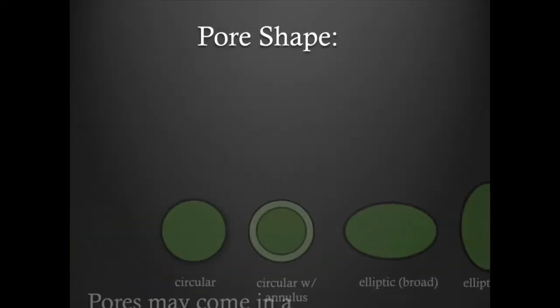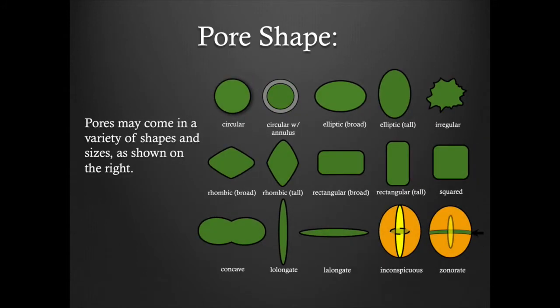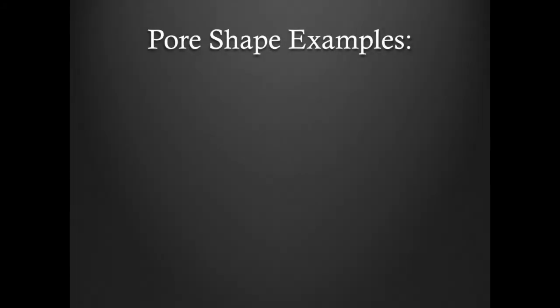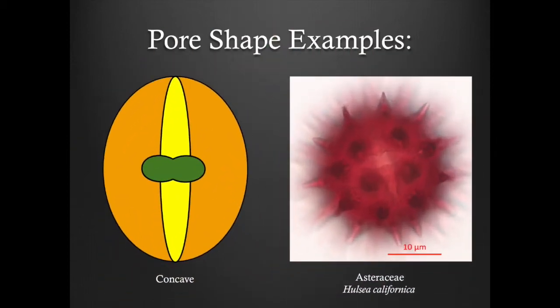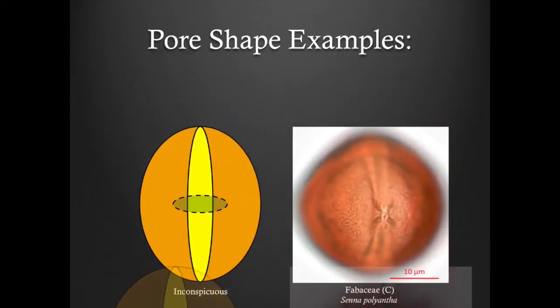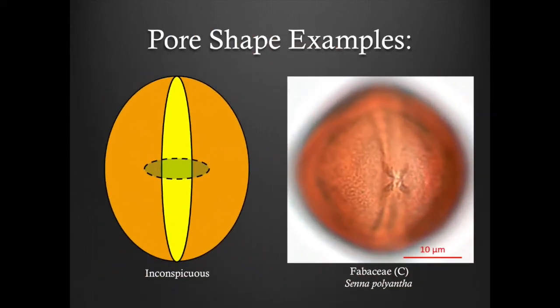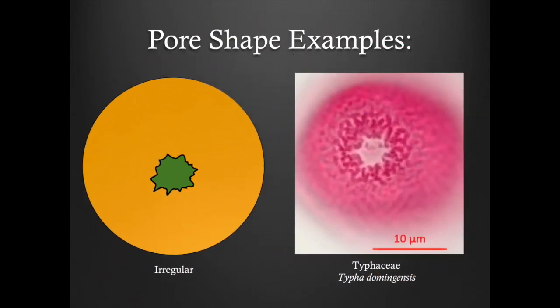Pore shape. Pores may come in a variety of shapes and sizes, making it a helpful morphological tool for pollen identification. The shapes generally range from circular or squared to elliptic or rectangular, or the pores can even be irregularly shaped or inconspicuous. Here are some examples of pore shape: a circular pore with an annulus, a concave pore, an inconspicuous pore, and an irregular pore.